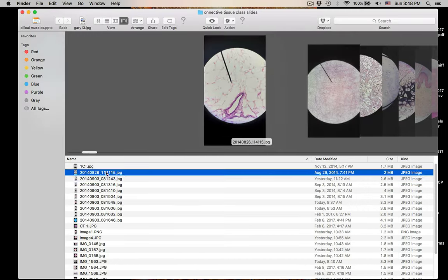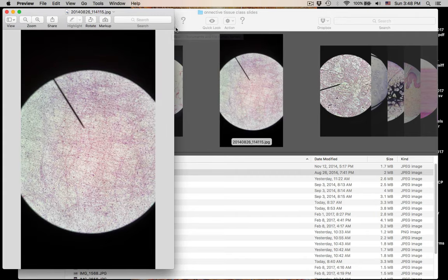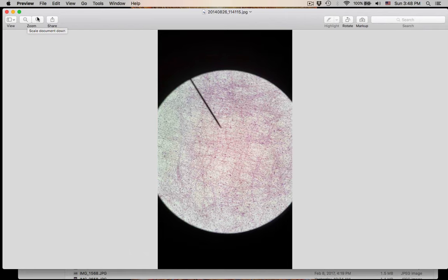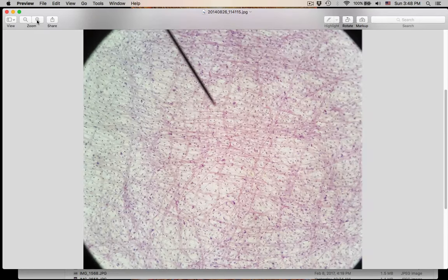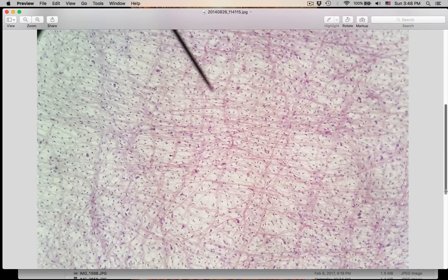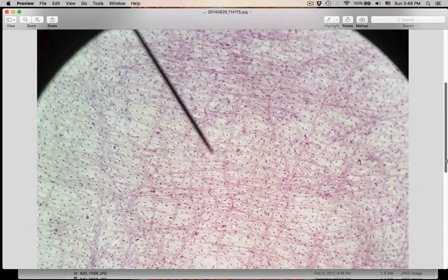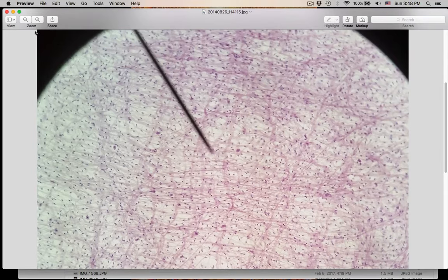Number two. Let's get a little bit closer with this one. You should be able to tell what type of connective tissue this is. It's not a great slide, but it's a good slide. What type of connective tissue is this? What's the name of this connective tissue?